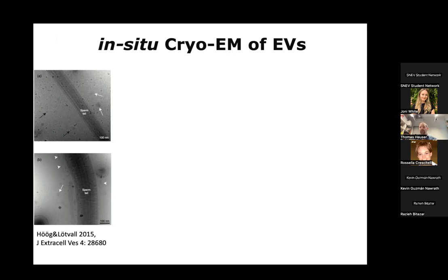If you have a very low concentration of EVs, there's no way you can visualize them directly. That would be the famous finding a needle in the haystack. And cryo-EM is a bad method for screening large areas.